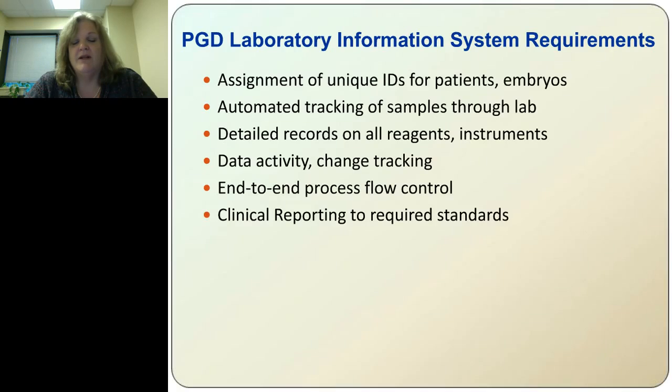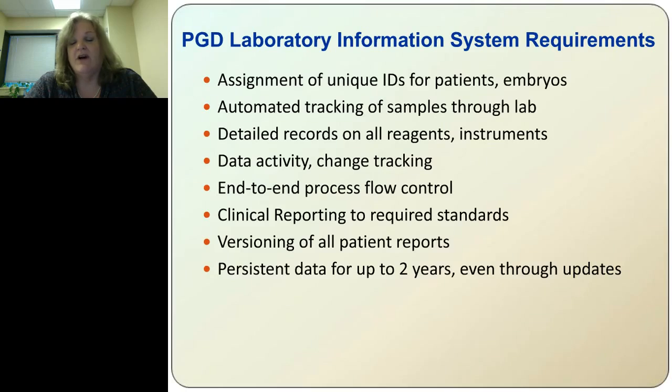We need clinical reporting to required standards that are laid out by the accrediting bodies. And we also need to version all patient reports so that all software and methods that we're using are correctly attributed to the version that they were calculated under, so we can go back and redo the calculation in future days, knowing what software version we used. And of course, we need persistent data for 2 years, even through database updates.